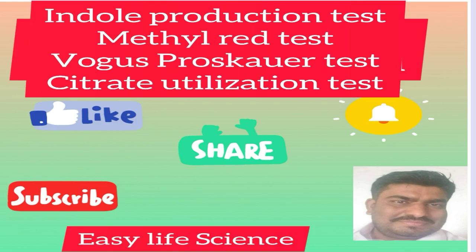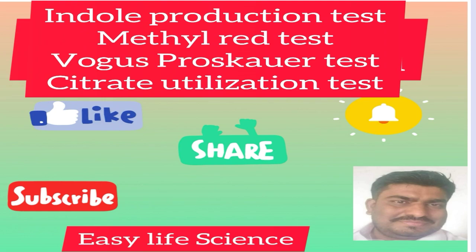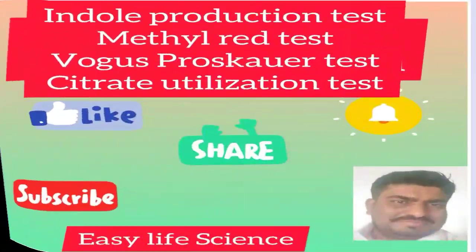Here I am talking about the IMViC test. The IMViC test is not a single test, but a combination of four different tests, including the indole production test, methyl red test, Voges-Proskauer test, and citrate utilization test.